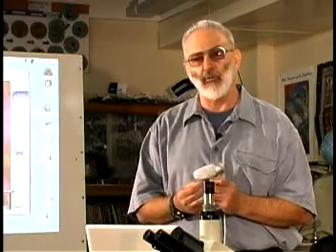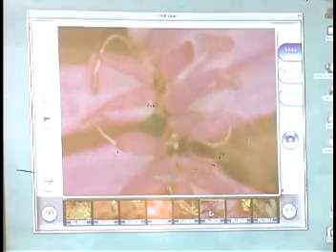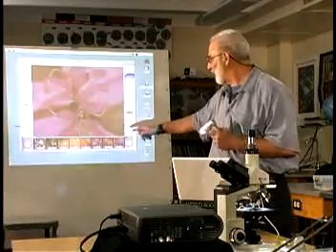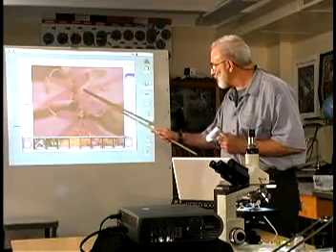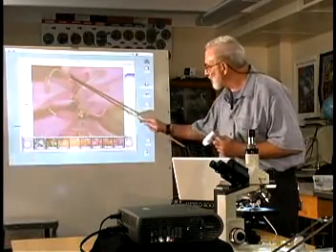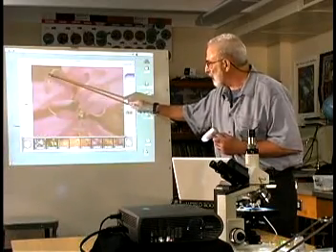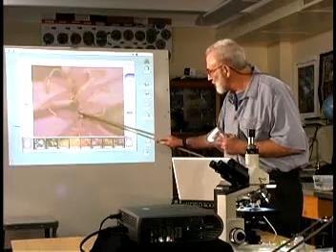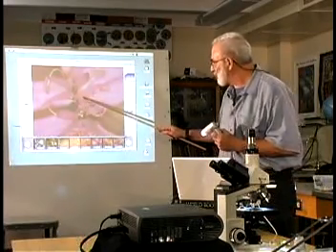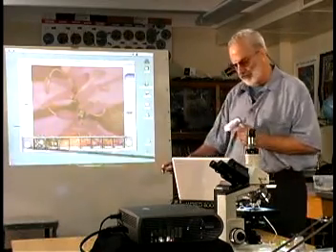First thing we're going to do is grab one of our flowers and zoom in on it, and capture a picture. That's the picture I just captured. What we're looking at here are the petals all the way around. And in the center, we can see one of the anthers, the stamen, and the filaments, the anther and the filament. And down in here we can see the top part of the pistil, and so when we open this flower up, we'll be able to examine these particular parts a little bit better.